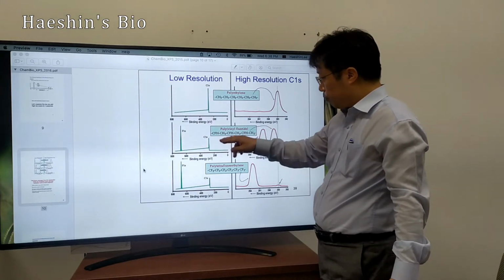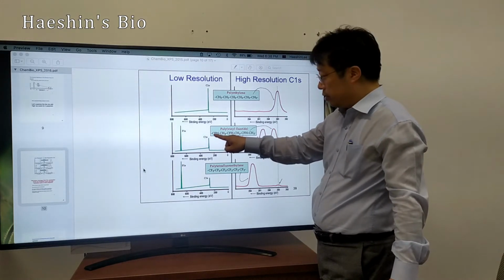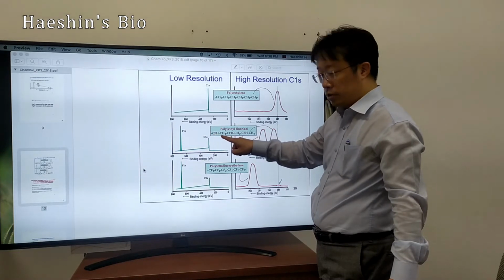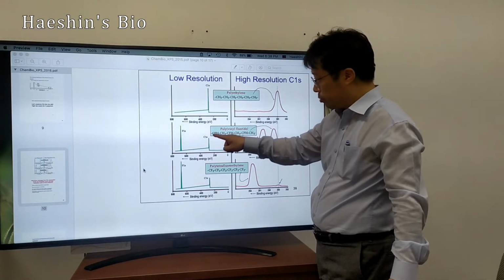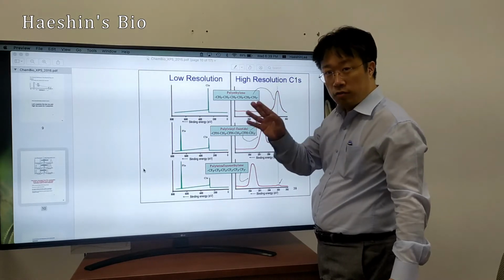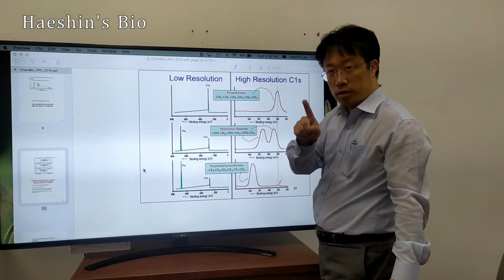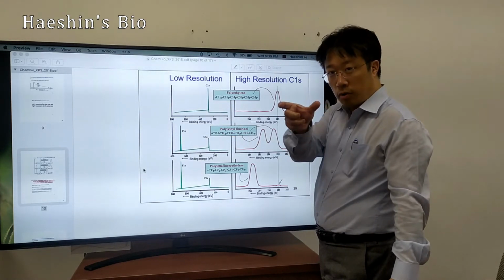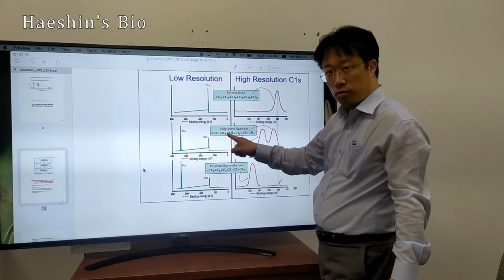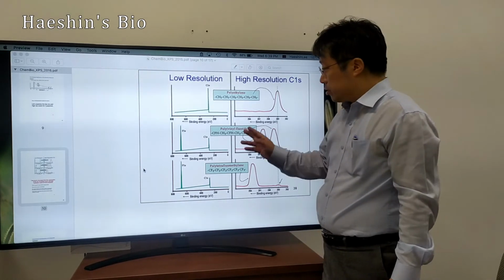So that's why this carbon is connected to fluorine, and the stoichiometry of this carbon and this carbon are in a different environment, which is also carbon to carbon connections. There is no influence from this fluorine on this carbon, because I emphasized the one bond rule. This carbon has one bond here. There's no influence from the fluorine. So it's like 1 to 1.